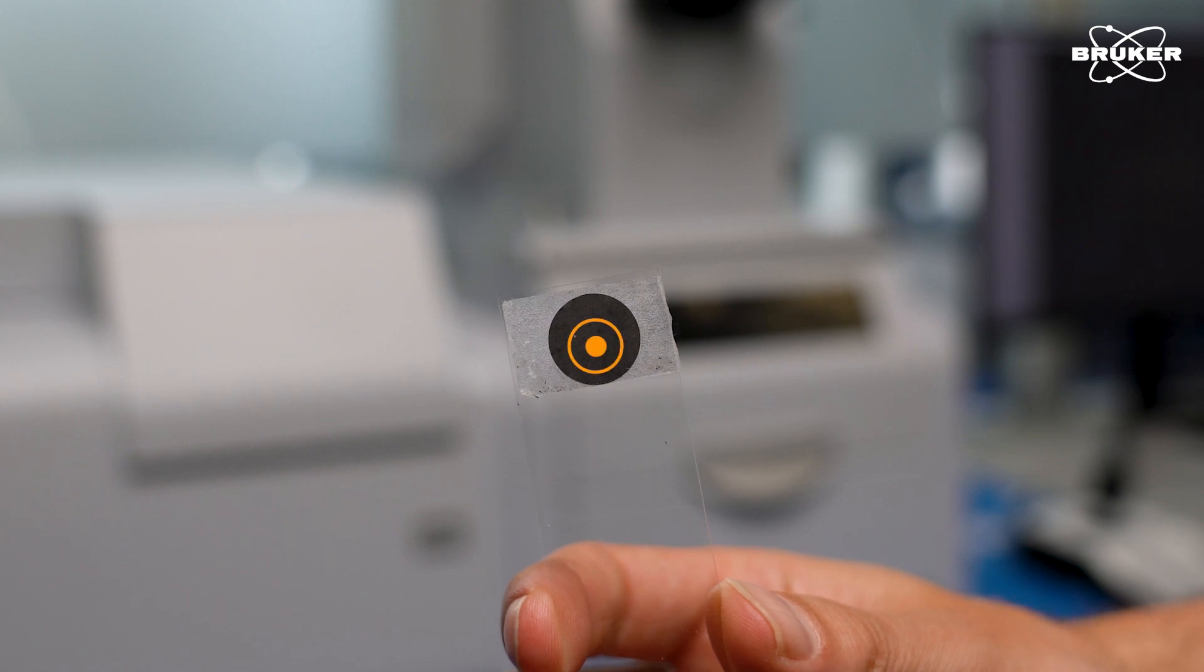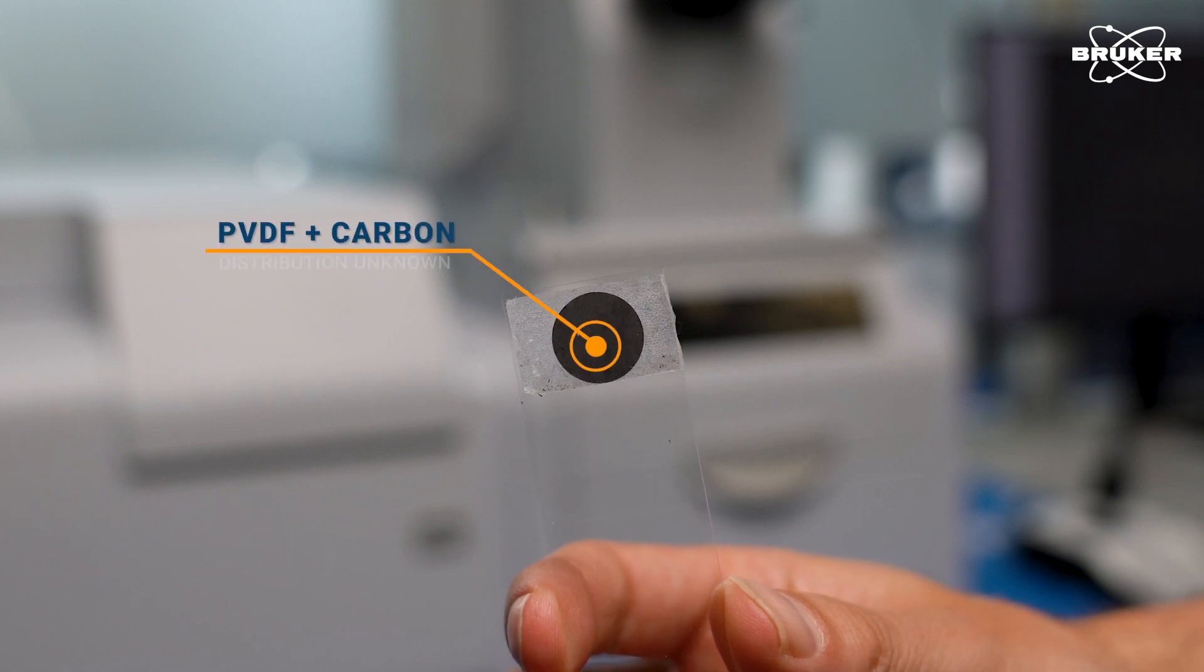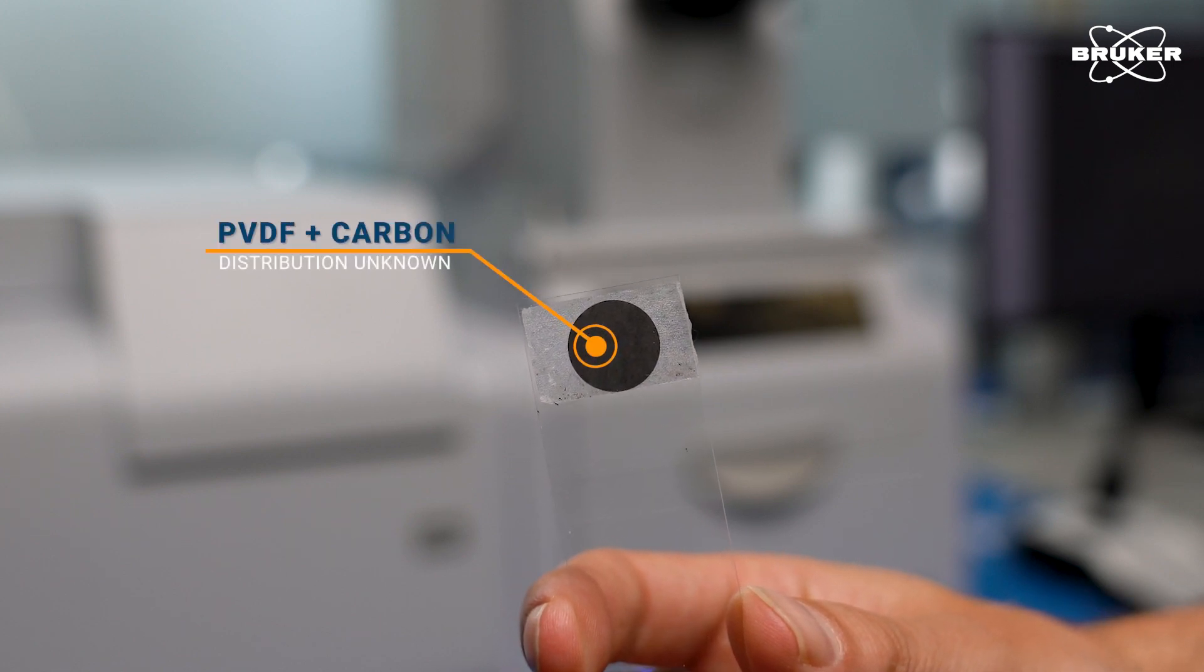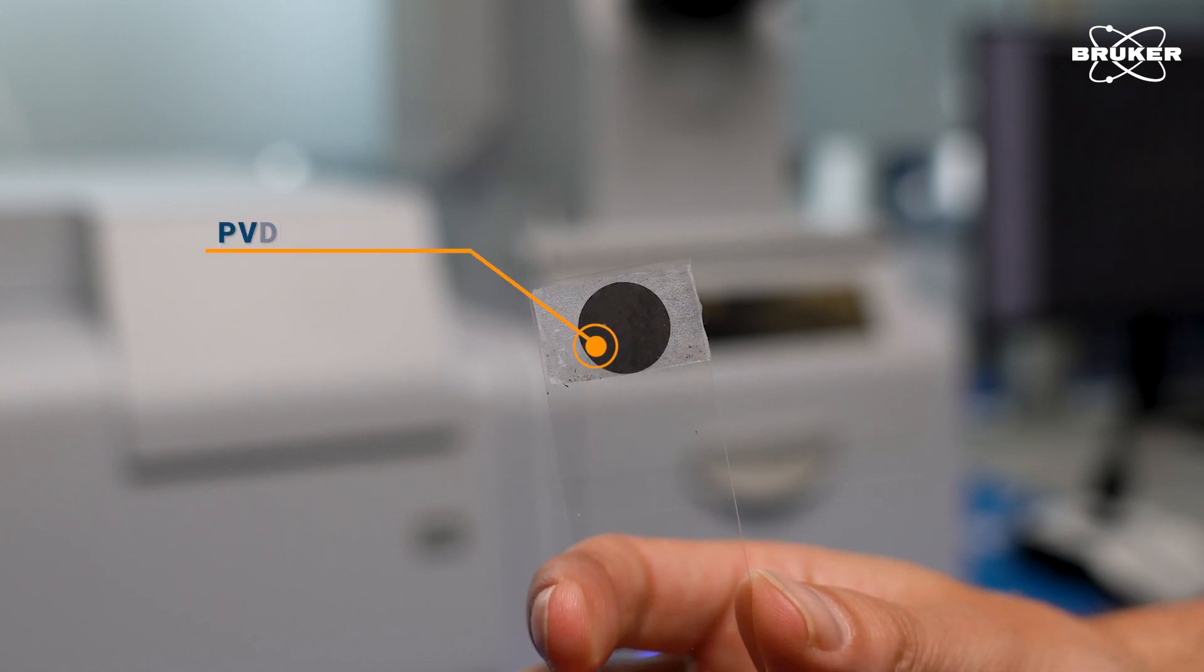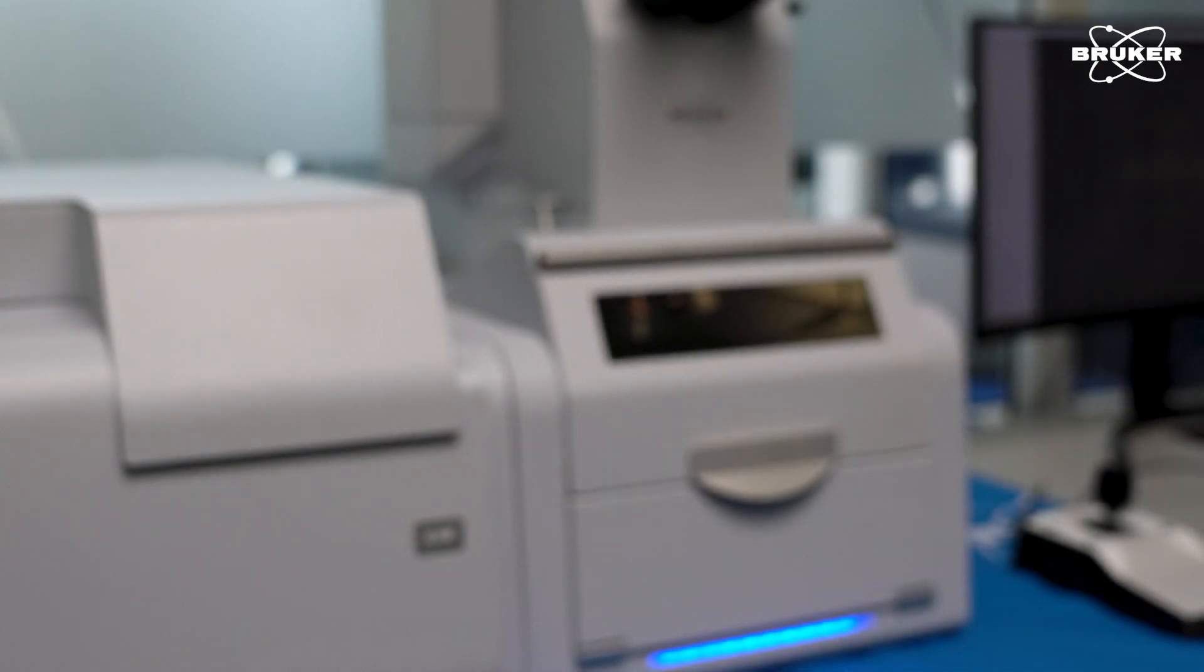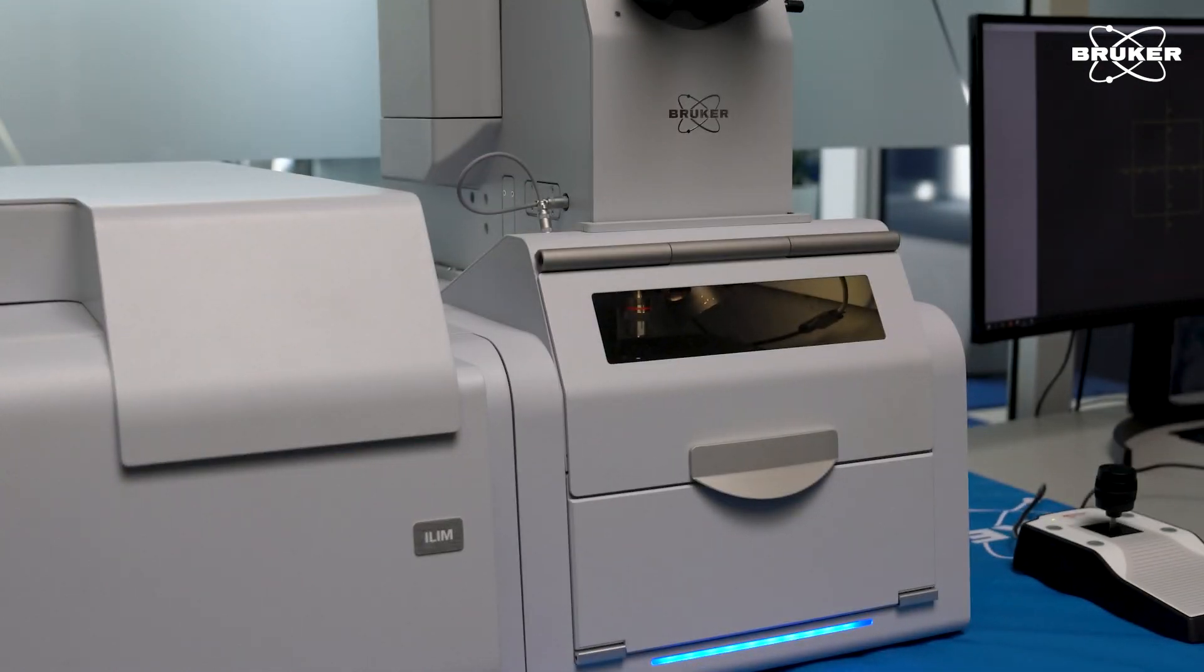In this video, we use infrared laser imaging to determine and visualize the distribution of PVDF binder within a commercial lithium-ion battery anode.